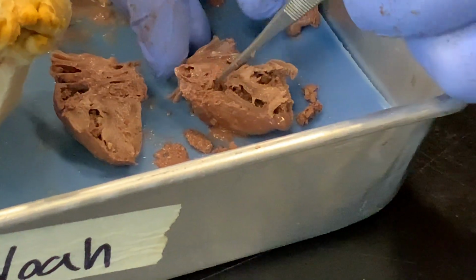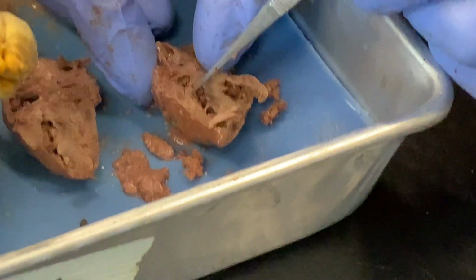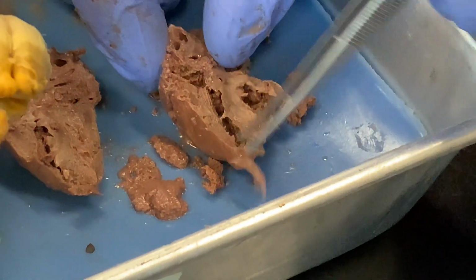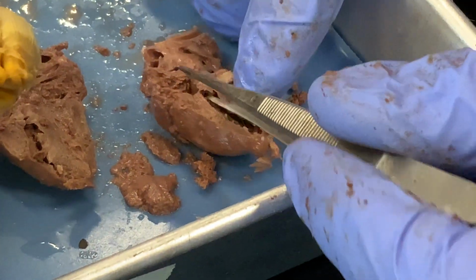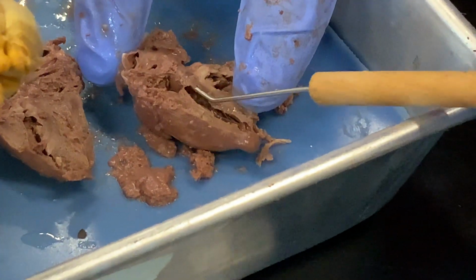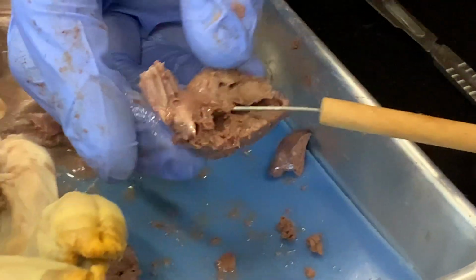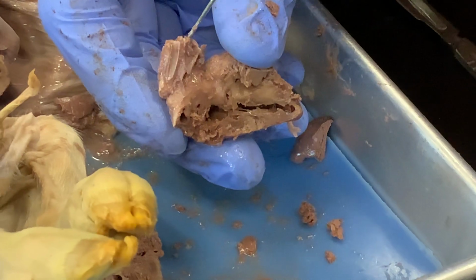There we go. And when the heart contracts, blood flows through this structure right here, which is the bicuspid valve, into the left ventricle, which is the biggest, muscliest portion of the heart. And when that contracts, blood leaves through this tube right here, through another valve, into what is called the aorta. The aorta opens, the other end of it is right here. So it comes up, curves around.